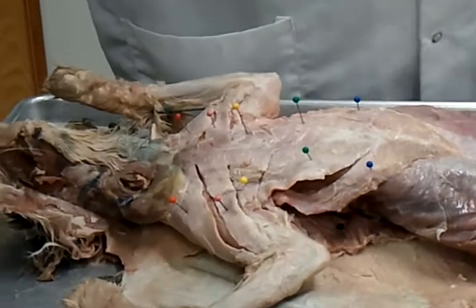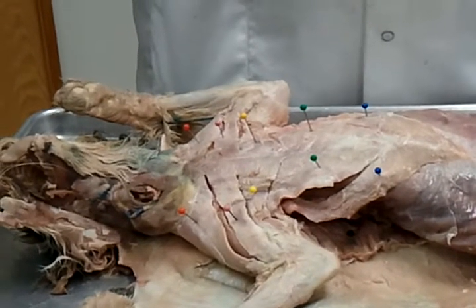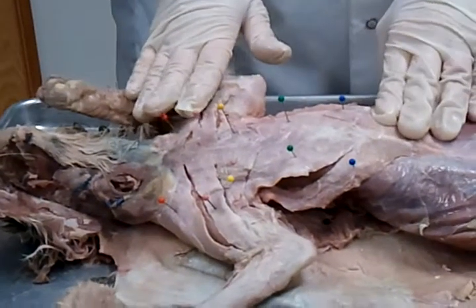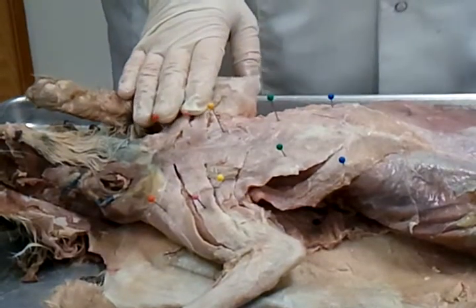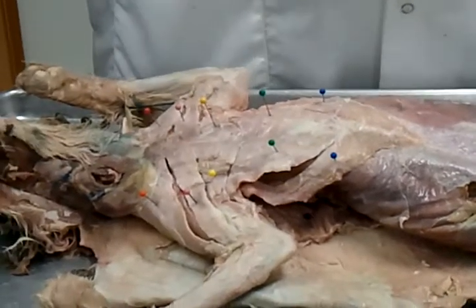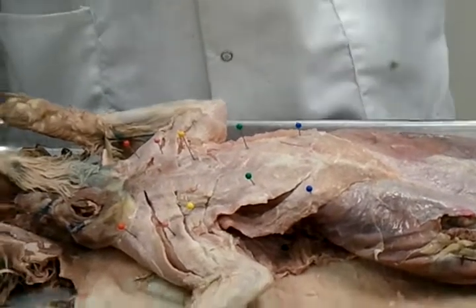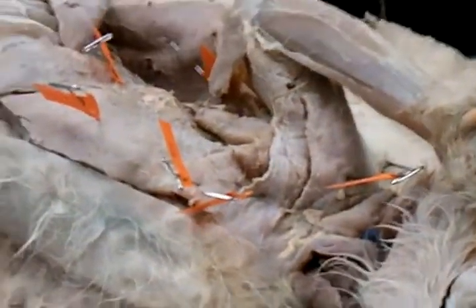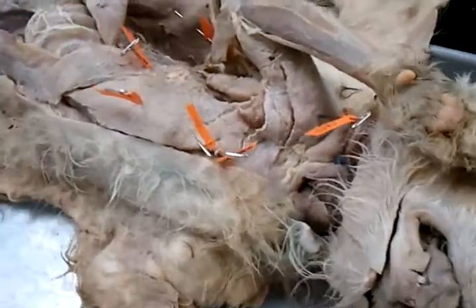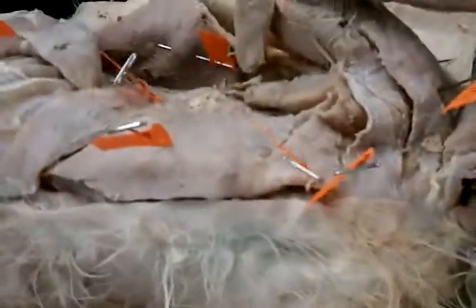They're numbered on this cat, so you can figure out what they are in terms of your sheet and pinned. They're pinned with colors on this cat, and then they're around the room on some other cats where they've actually been cut, like on that one right there, a little bit to expose deeper muscles. And that is actually why you guys have had your cat skinned on both sides. So we'll do superficial on one side and deep on the other, so it doesn't totally mess you up when you only have 2 days to learn them. Okay? So you need to try to get those down.